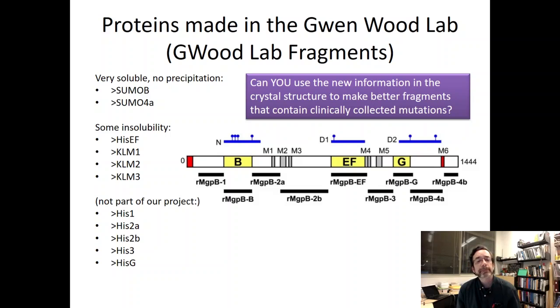And they found that from the fragments that they made, the B fragment works really well in the tube, and the 4A fragment works really well. I just showed you the experiments from those. The reason why we haven't looked at more fragments is partially because when they made the other fragments based on the gene sequence, the variation that they saw in the gene sequence, they didn't get good fragments out the other side. They would crash out of solution. They wouldn't fold right.